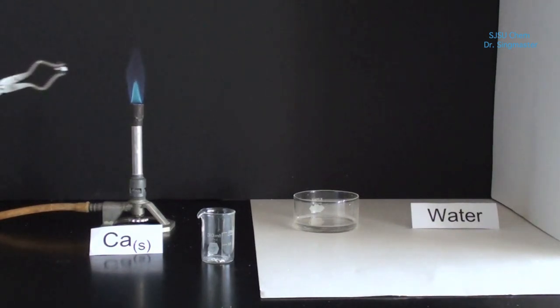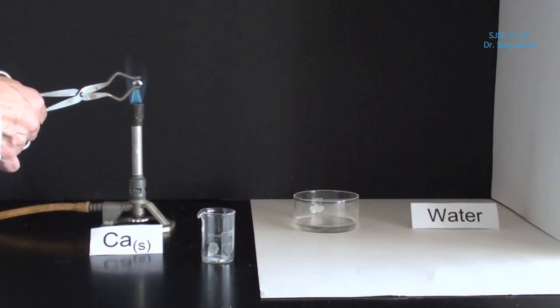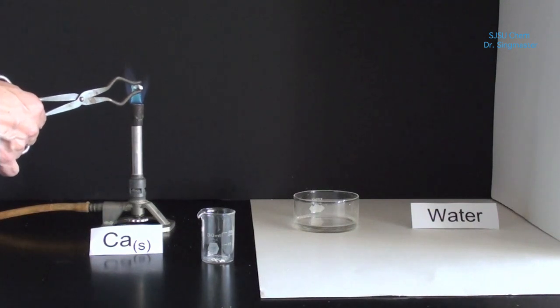We're going to take a piece of calcium and burn it in a flame in the presence of oxygen, which is present in the air.